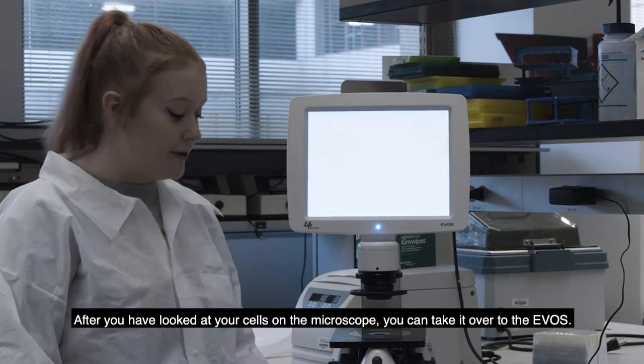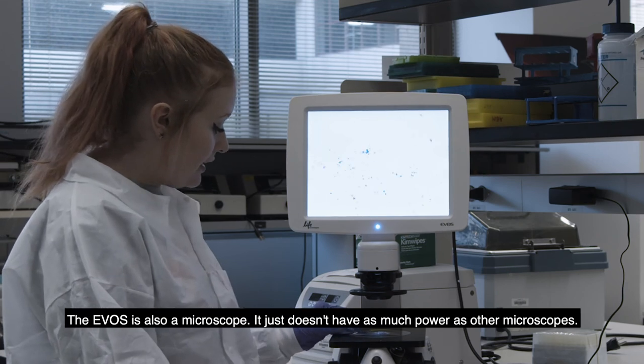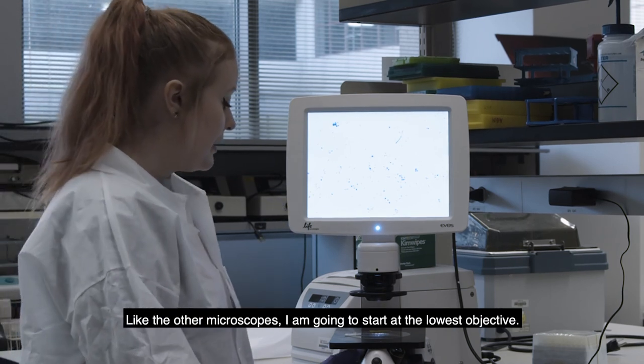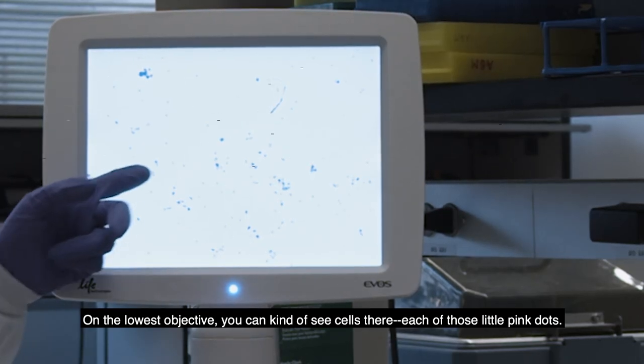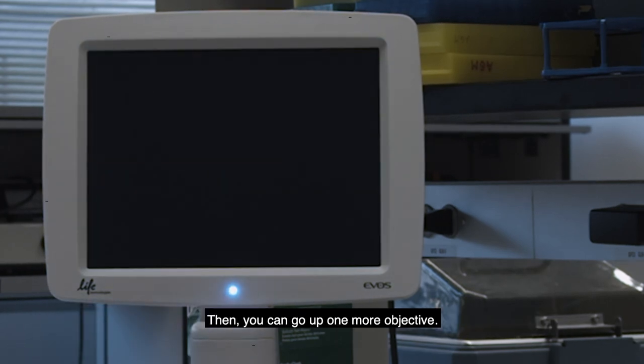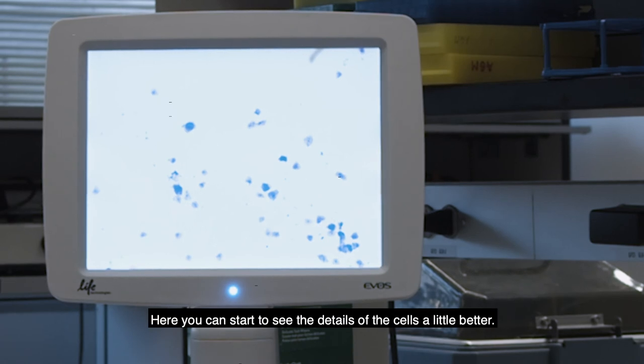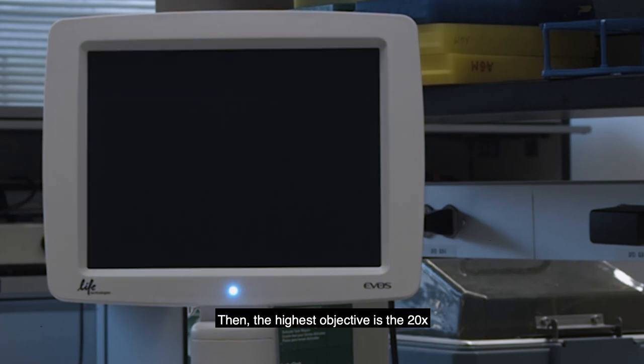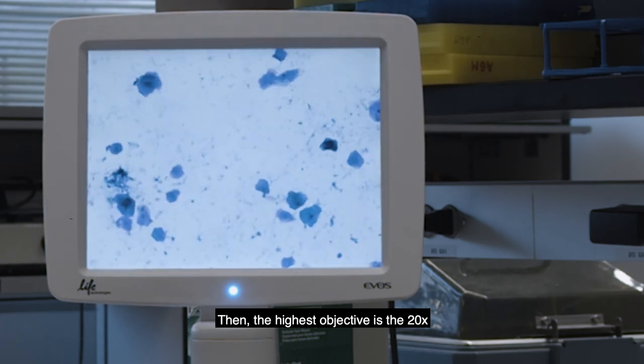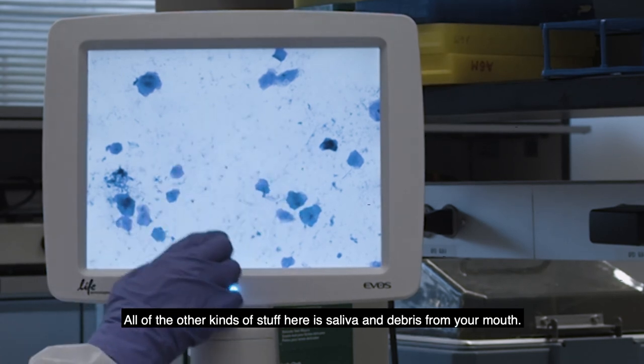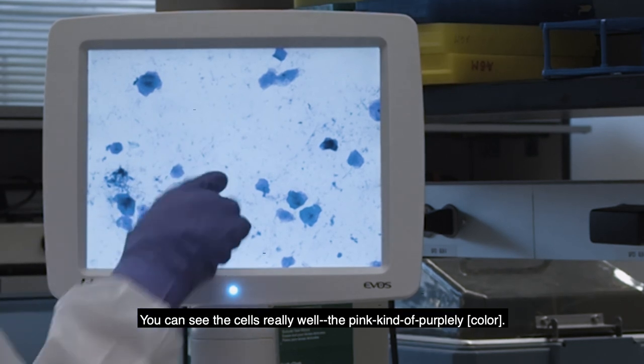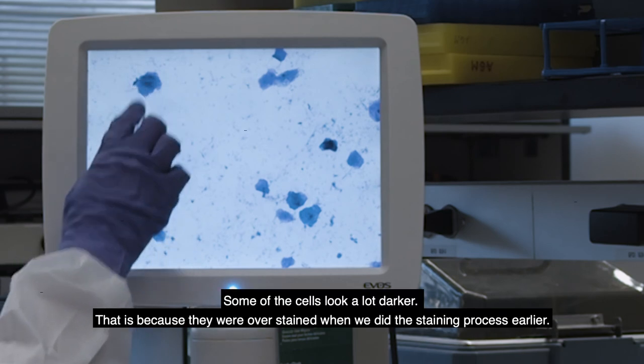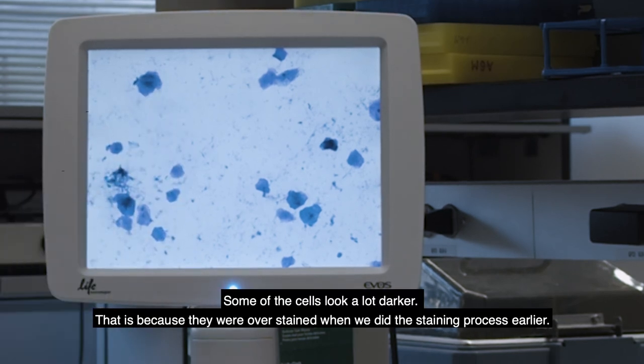So after you've looked at your cells on the microscope, you can take it over to the EVOS. So the EVOS is also a microscope. It just doesn't have as much power as the other microscopes. But it does have the monitor which helps you visualize the cells better. So like the other microscopes, you want to start at the lowest objective. So on the lowest objective, you can kind of see the cells there, each of those little pink dots. And then you can move up one more. And then there you can start to see the details of the cells a little better. And you might have to focus and adjust some things as you go up each objective. And then the highest objective is the 20x. So here you can see the cells pretty well. So all of the kind of other stuff here is just saliva and debris from your mouth. And then you can see the cells pretty well. The pink kind of prickly. And then you can see the darker purple dot in the middle, which is the nucleus of each of the cells. And some of the cells look a lot darker. And that's just because they were overstained when we did the staining process earlier.